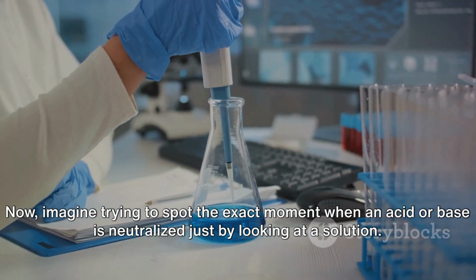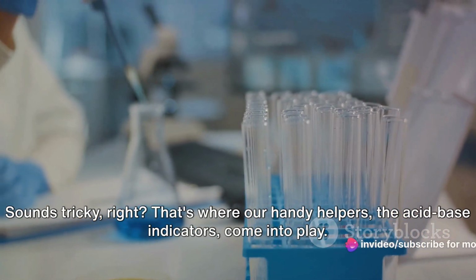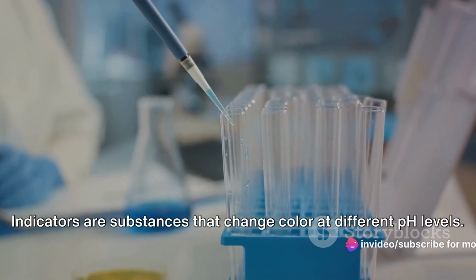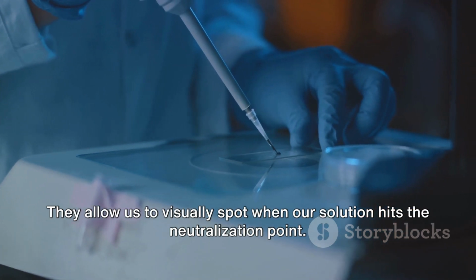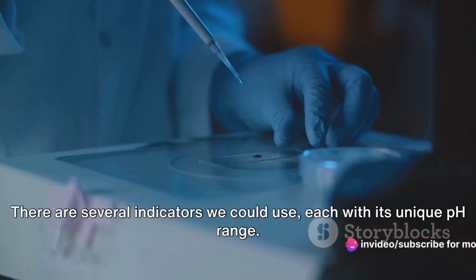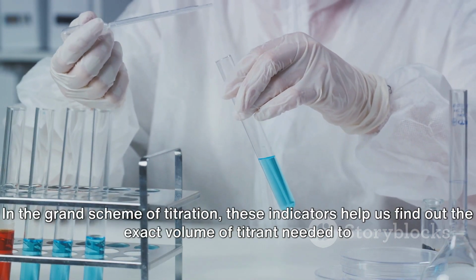Now imagine trying to spot the exact moment when an acid or base is neutralized, just by looking at a solution. Sounds tricky, right? That's where our handy helpers, the acid-base indicators, come into play. Indicators are substances that change color at different pH levels. They allow us to visually spot when our solution hits the neutralization point. There are several indicators we could use, each with its unique pH range. Some common ones include litmus, phenolphthalein, and bromothymol blue.